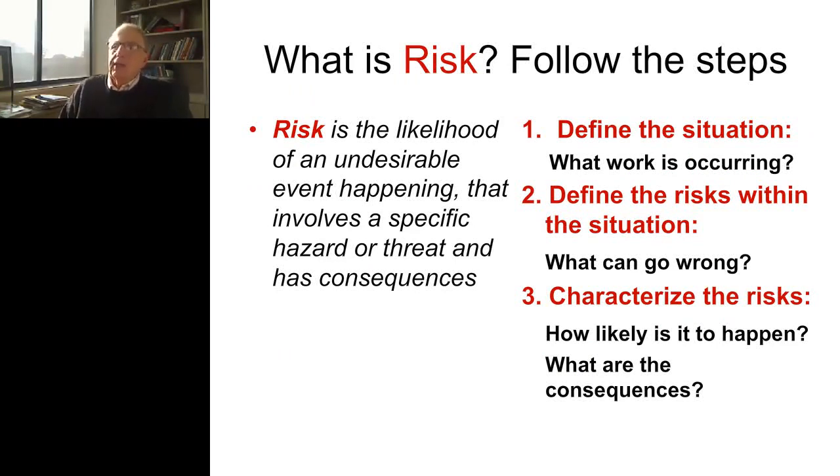And I'll give you the basic definition. Risk is the likelihood of an undesirable event happening that involves a specific hazard or threat and has consequences. So you look at the following steps when you're looking for risk. So you're looking at what work is occurring in the laboratory to define the situation. So if you're working at a setup bench, you're working with specimens, and you're defining the situation of what you're doing with those specimens. You define the risk within the situation.